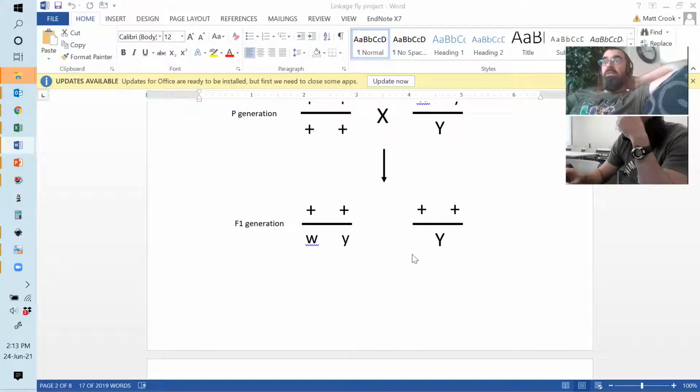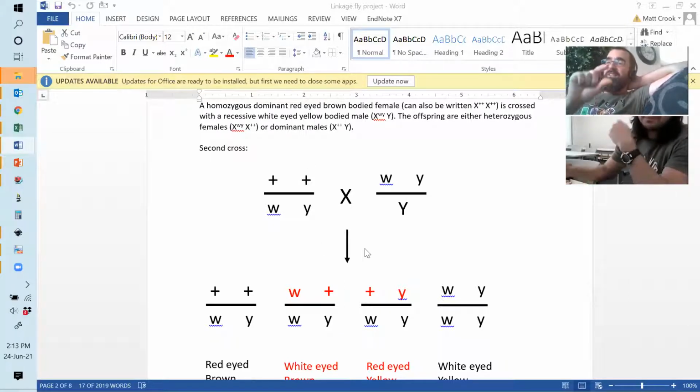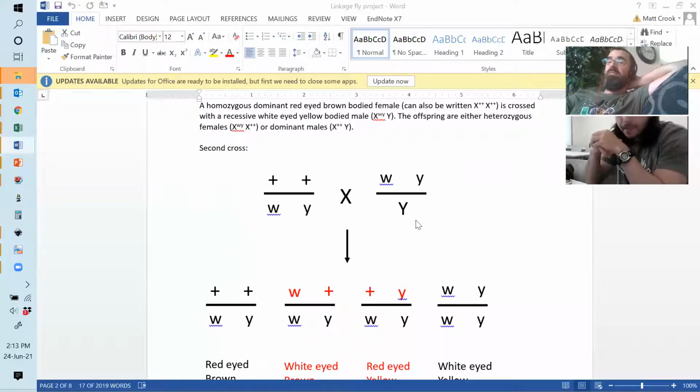In real life, we actually kill them, but because this is online, virtually. Anyway, probably not the time for jokes. It's actually called the fly morgue. It's a little container full of, I think, ethanol. You just put them in there and they die happy, or they just never wake up, basically. So yeah, there's like little cross-eyed flies on them.